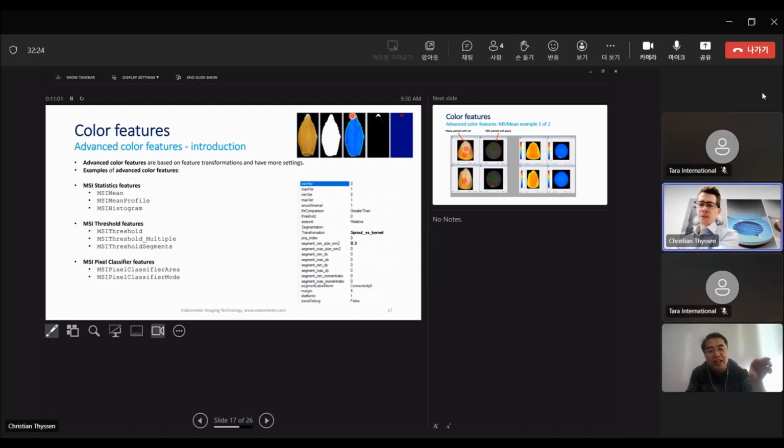Yes, if you make the area, maybe we assign the class as germination, non-germination. At that time, we usually paint the whole grain. I usually do that. Instead of painting the whole grain, how about extracting the sprout area instead of the whole grain? How about this one? Is it better than my existing method or not? That's just my question.